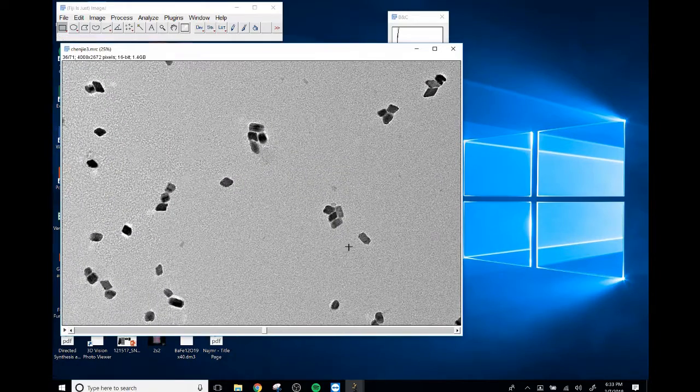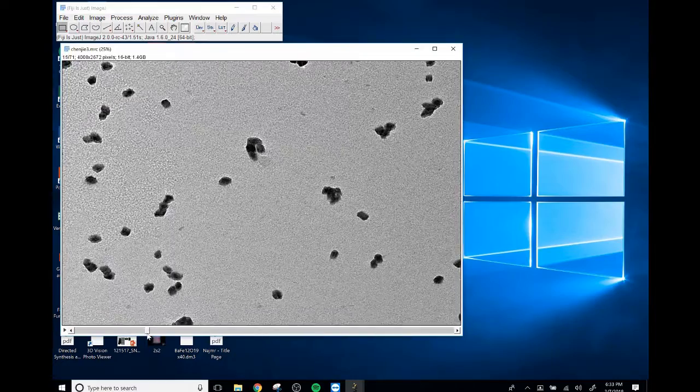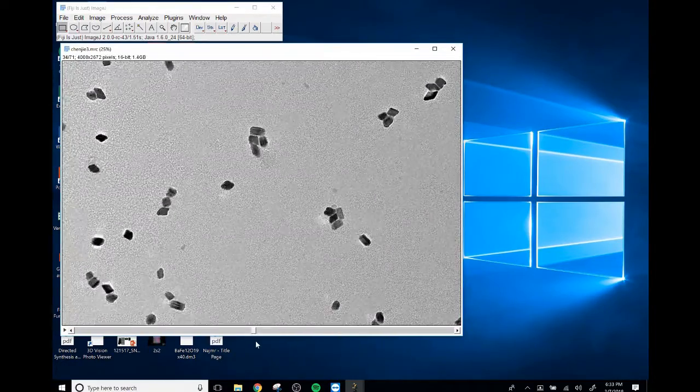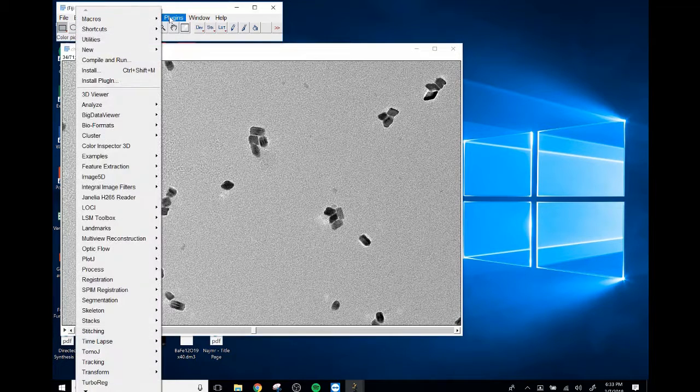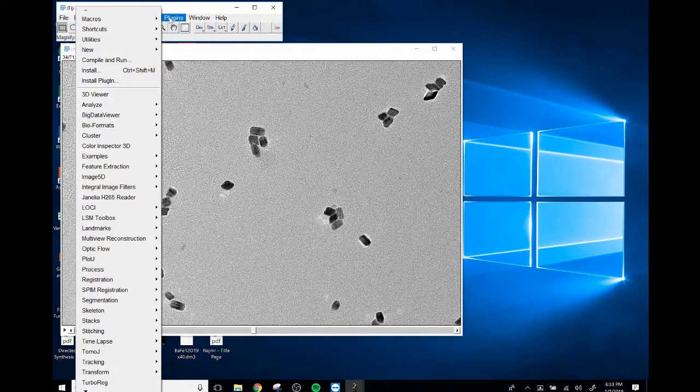So this worked pretty well. This we can close now. All right, so now that we've normalized the contrast a bit, what we'll do is a registration. We fixed one problem with the darkness, now we have to fix the other problem, the misalignment. What this will do is take the image and move them into similar positions based off of the particle triangulation.